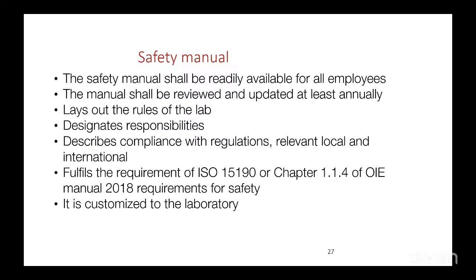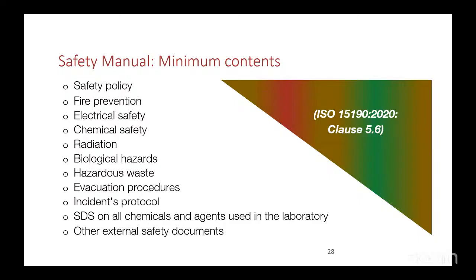So it must be customized to suit what? The laboratory. So now look at it. What should be the content of a safety manual?